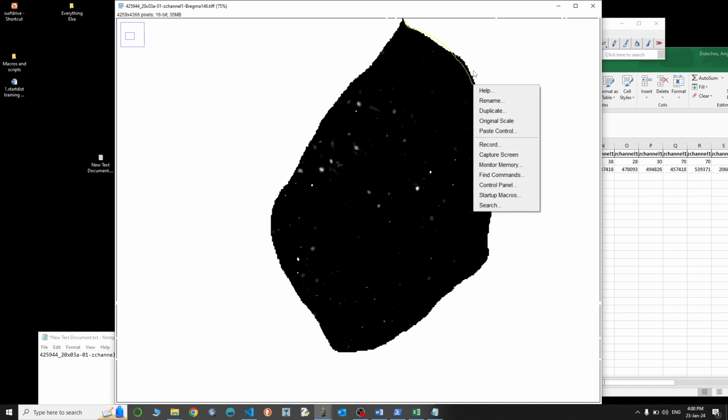Whoops, okay. Let's try again. I don't think I'm that bad. Certainly I'm not good for a surgeon, but roughly.